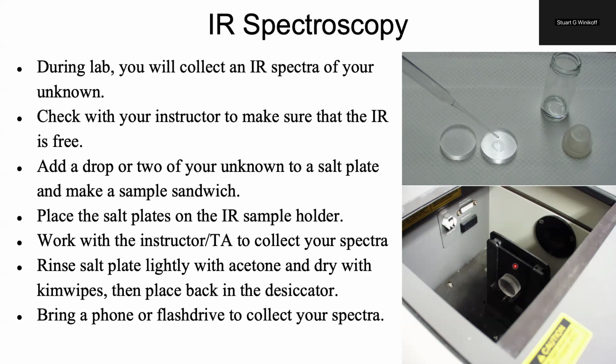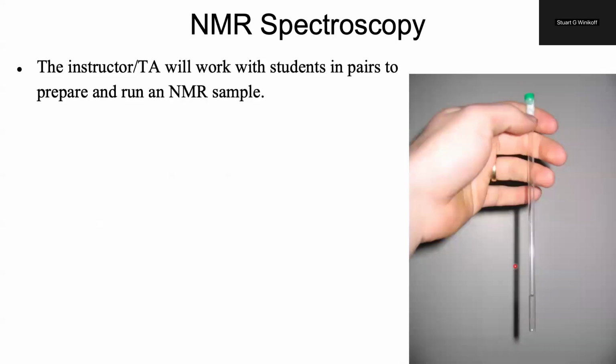Then you're going to either want to bring a phone so you can take a photo of your spectra, or a flash drive so you can directly download it from the computer so you have an image to analyze later if need be.